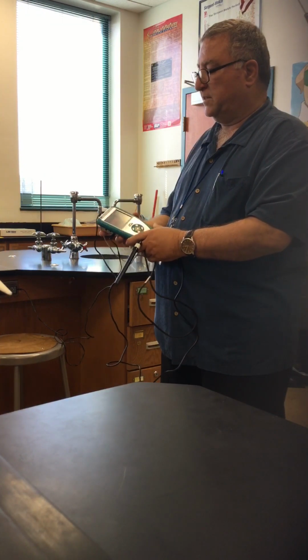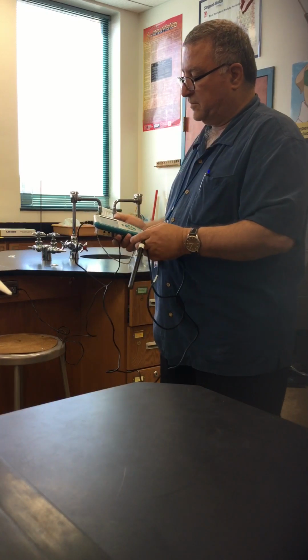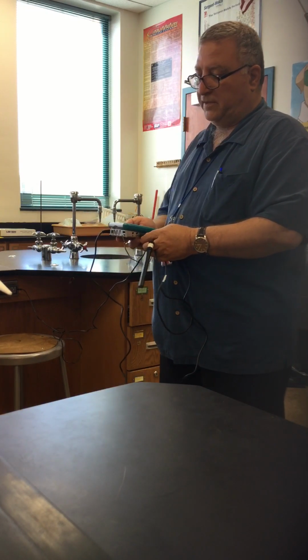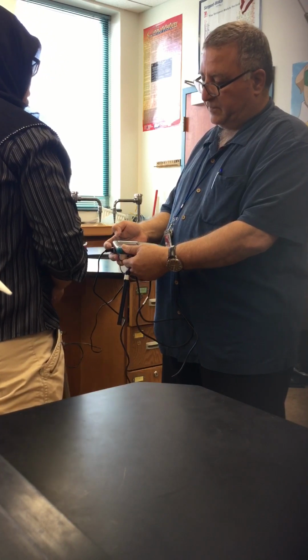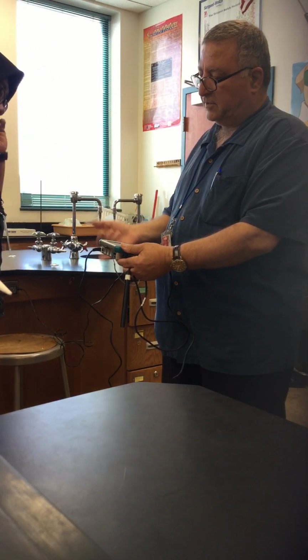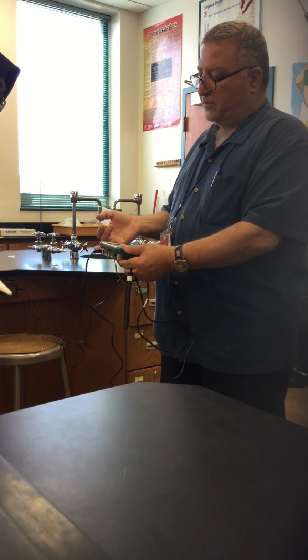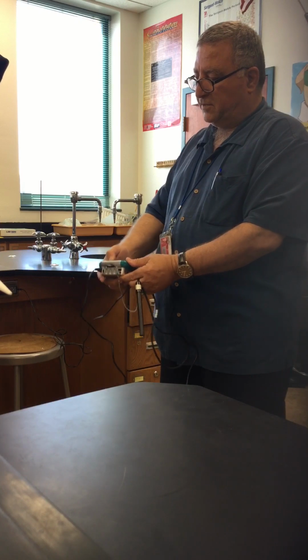LabQuest is the name of the machine. You can collect continuous readings, and you can have it graph them. You can record the data by hand, or in a table. You see here there is a table.